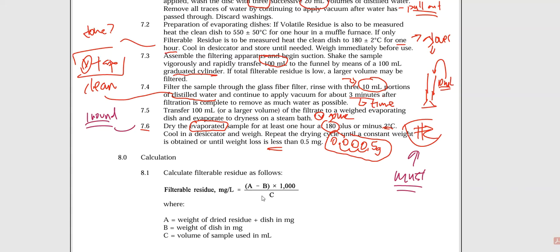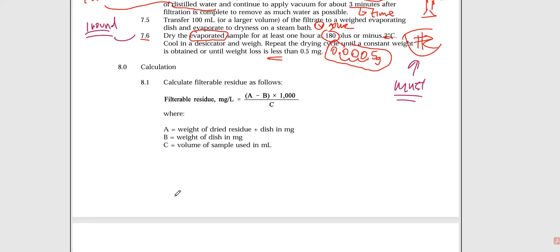But in our lab, we're going to do one round of heating, we cool it, and then we take a mass, and we're going to base our calculations off of that first mass that we obtained. Folks, we only have you for a certain limited amount of time. We don't have you all day. You're not working an 8-hour shift, and you're not coming in the very next day to pick it up and do it all over again. So because of that, we've got to make some exceptions, and this is one of the exceptions that we do.